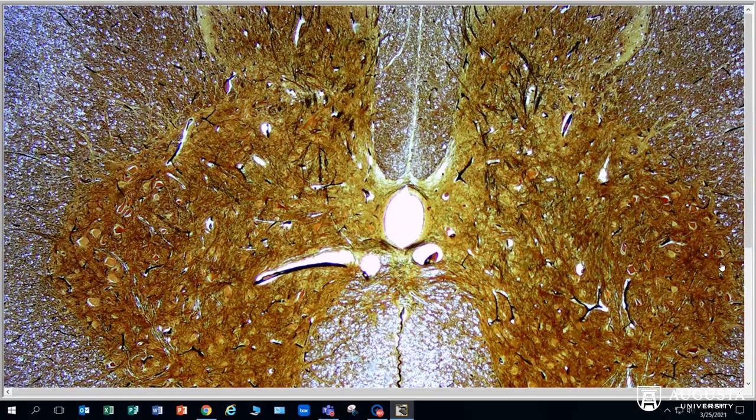This video will focus on the histology of the spinal cord. When you're viewing this slide in person, you'll be able to see more of the spinal cord at any given time. The camera that we use to capture the image of the microscope slide only allows us to see about 60% of the center of our viewing field. So when you're looking at this slide in person in the laboratory, you'll be able to see nearly the entire spinal cord when you're on the 4X objective.